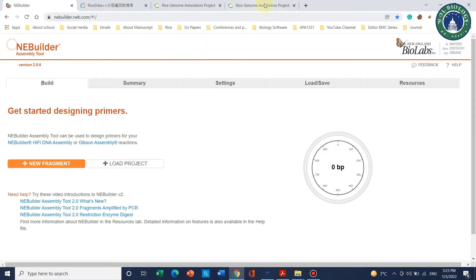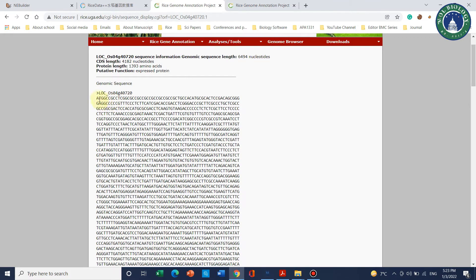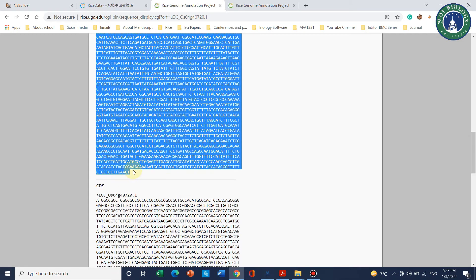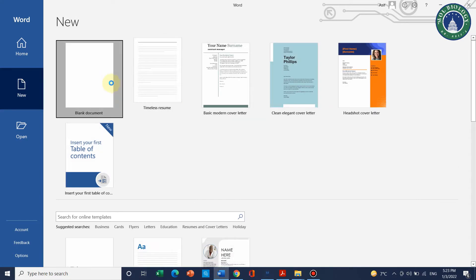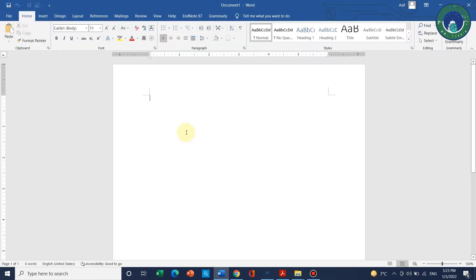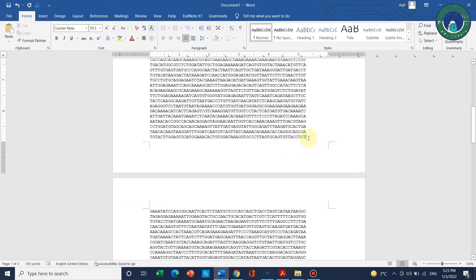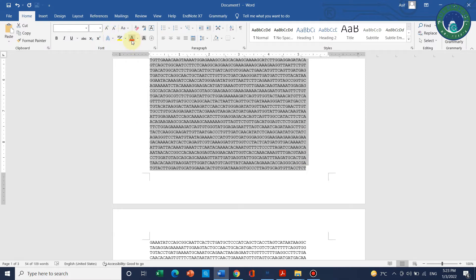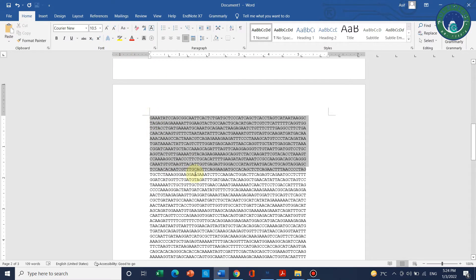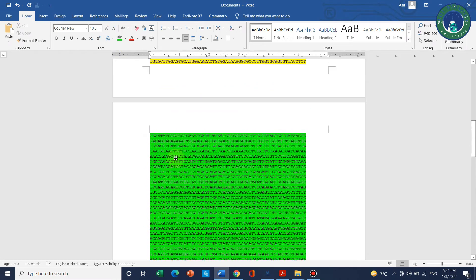We can clone this gene into two or three parts, and this tool will help you design your primers in parts. We will copy the sequence and divide it into two parts by opening a Word file, then paste the sequence there. The first fragment can be highlighted in yellow and the second fragment in green.